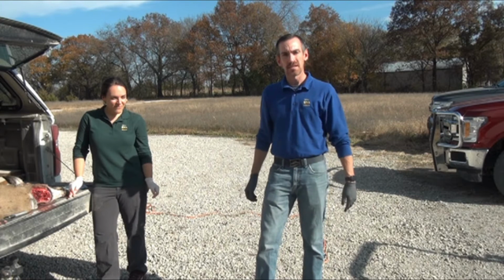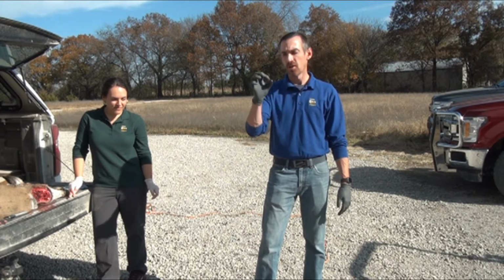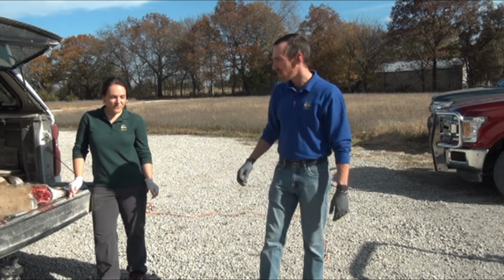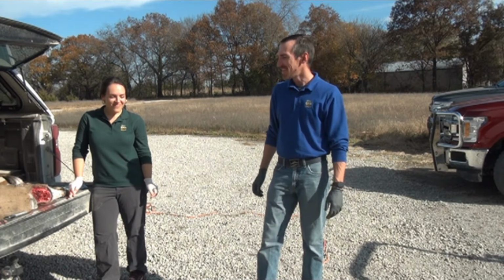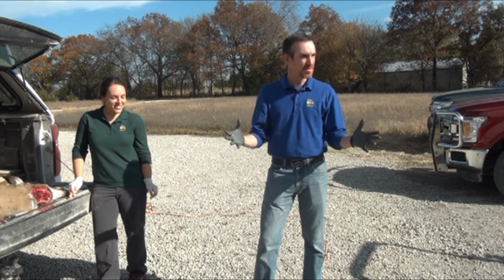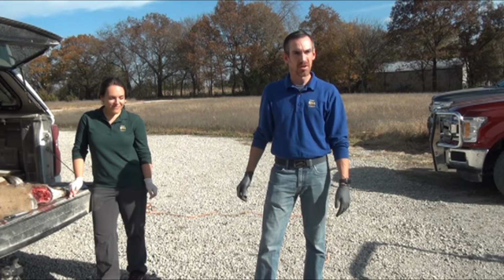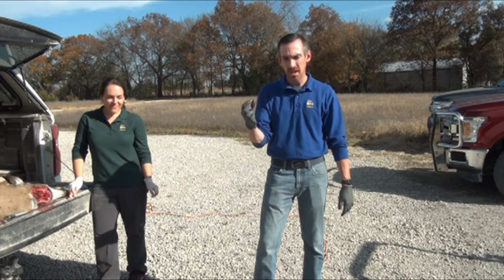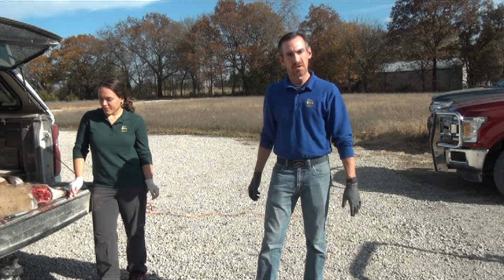Oftentimes what I've seen in my experience is that adult bucks like this will have one lymph node that's very large and another lymph node that's very small. There might be a biological or medical reason for that that I'm not aware of. It does tend to be smaller, but not always. Sometimes you'll get a doe that has fairly large lymph nodes as well. So size isn't a great reference. Again, you're just feeling around and looking for that solid tissue in there.